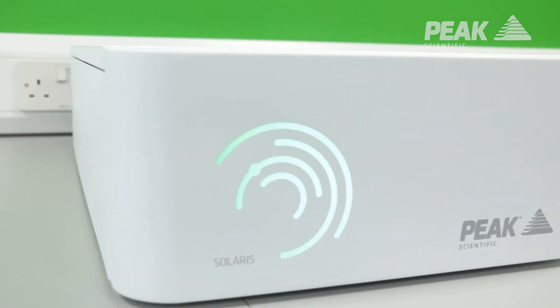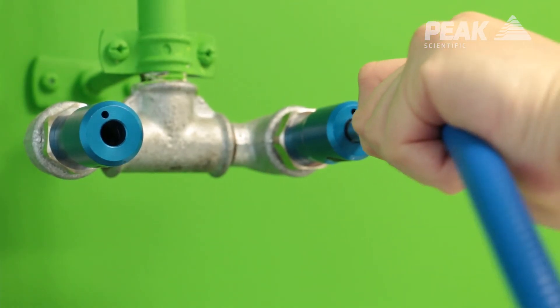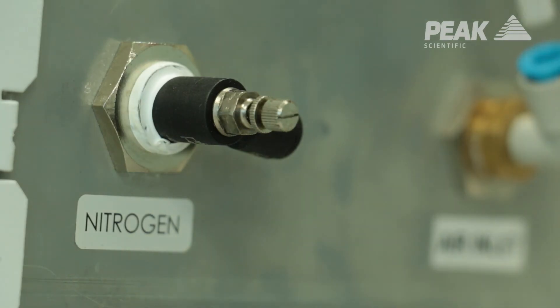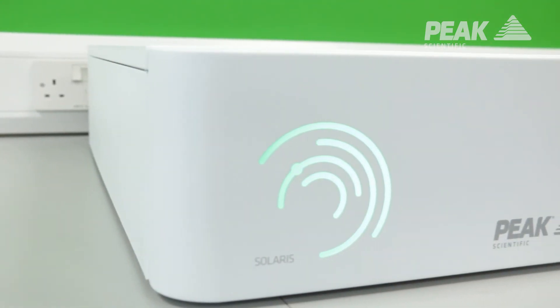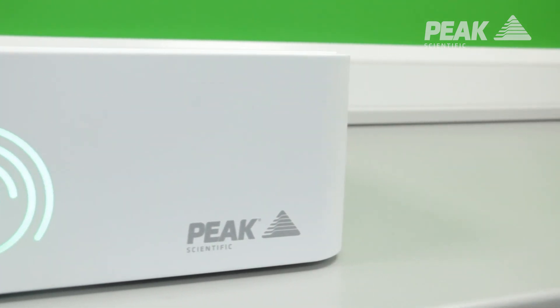Solaris XE requires an external air source. If your lab has in-house air, this can be connected to Solaris XE, or it can be connected to an external compressed air source. Solaris XE is based on our existing reliable and proven membrane technology. It's a truly versatile product in terms of outputs and space saving.